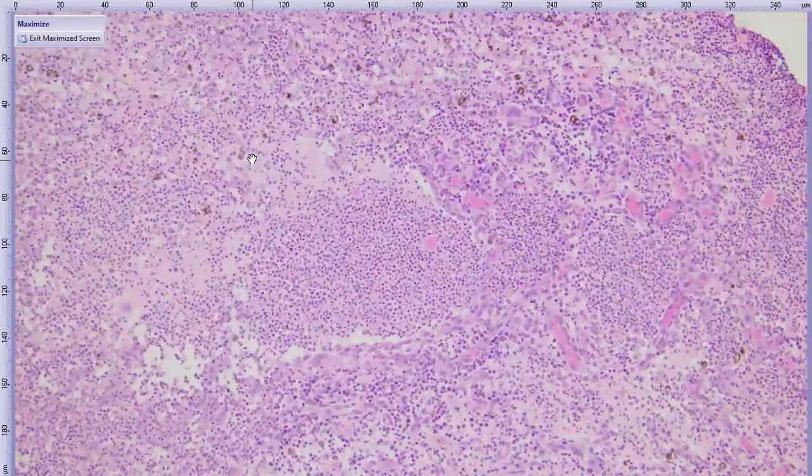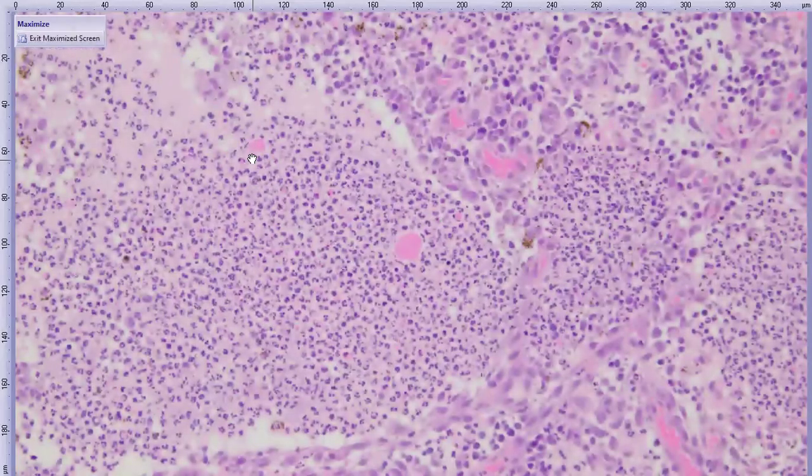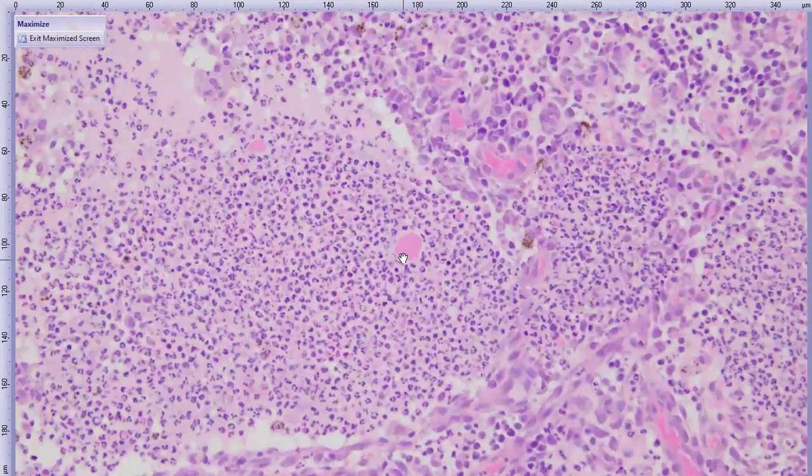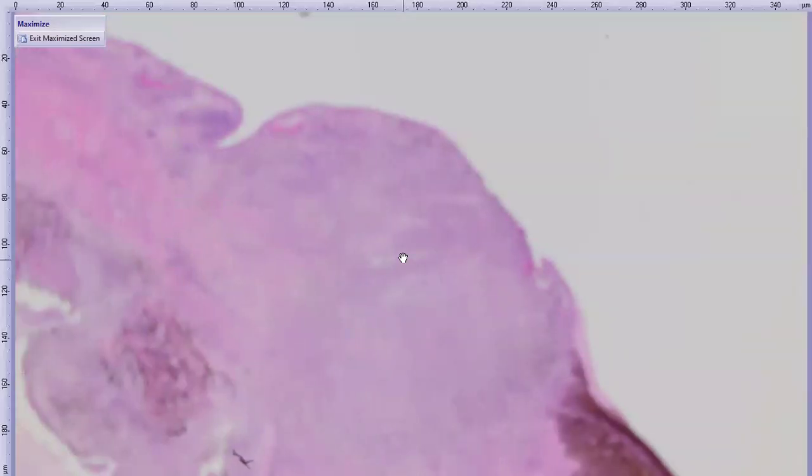inflammatory cells through that. And if we look amongst the inflammatory cells sometimes, we have the eosinophilic protein again. So there's actually lens protein leaking out through this gap in the limbal sclera. And this site is either basically a site of decompensation of the collagenous tunic associated with the inflammation itself, essentially a draining tract is what this may represent. Or it could be a site of penetrating trauma. And it would be difficult for us to be sure one way or the other. But either way, lens protein was basically leaking out through this gap, which is pretty interesting. I think that's everything I want to show you on the H&E.